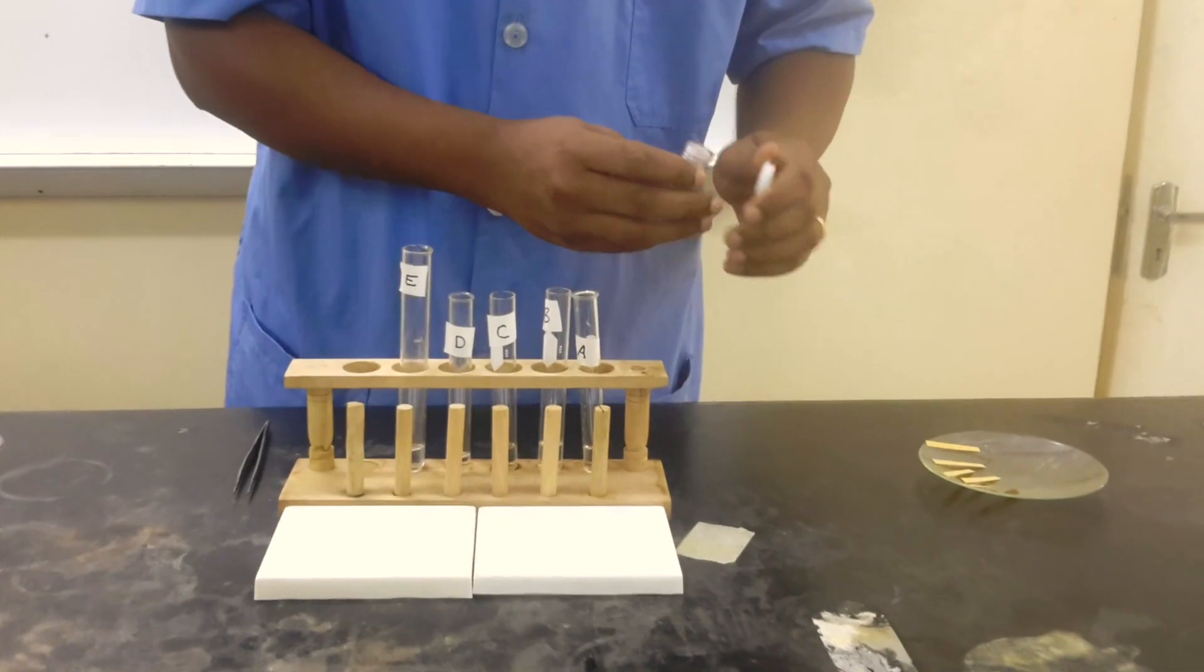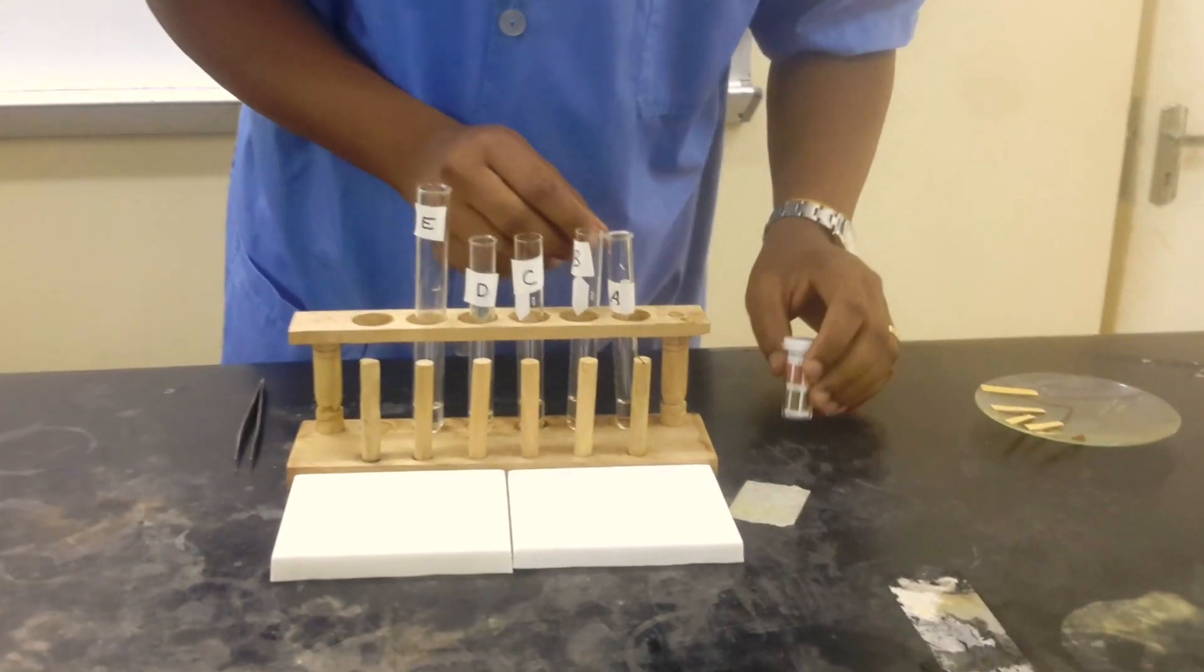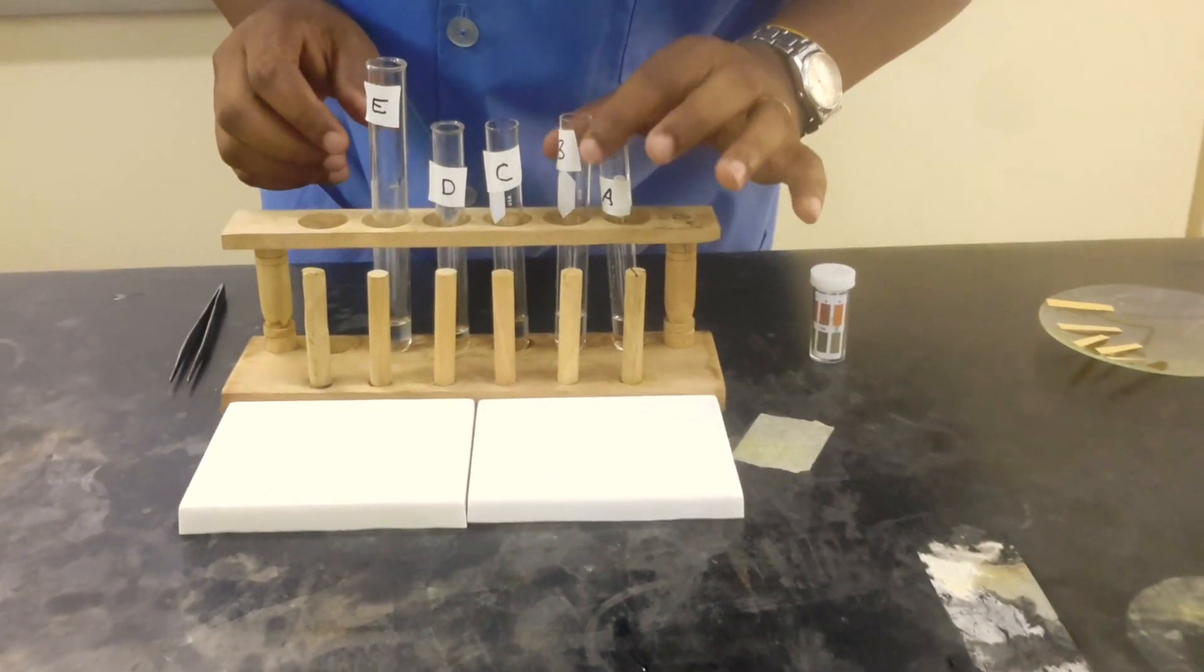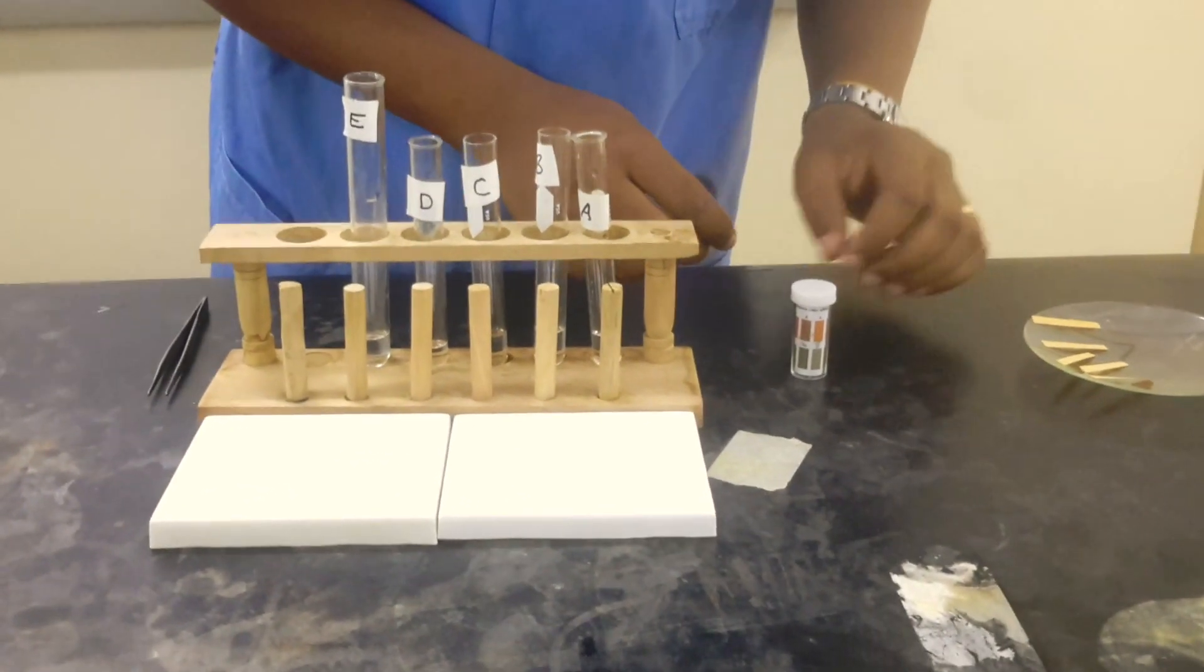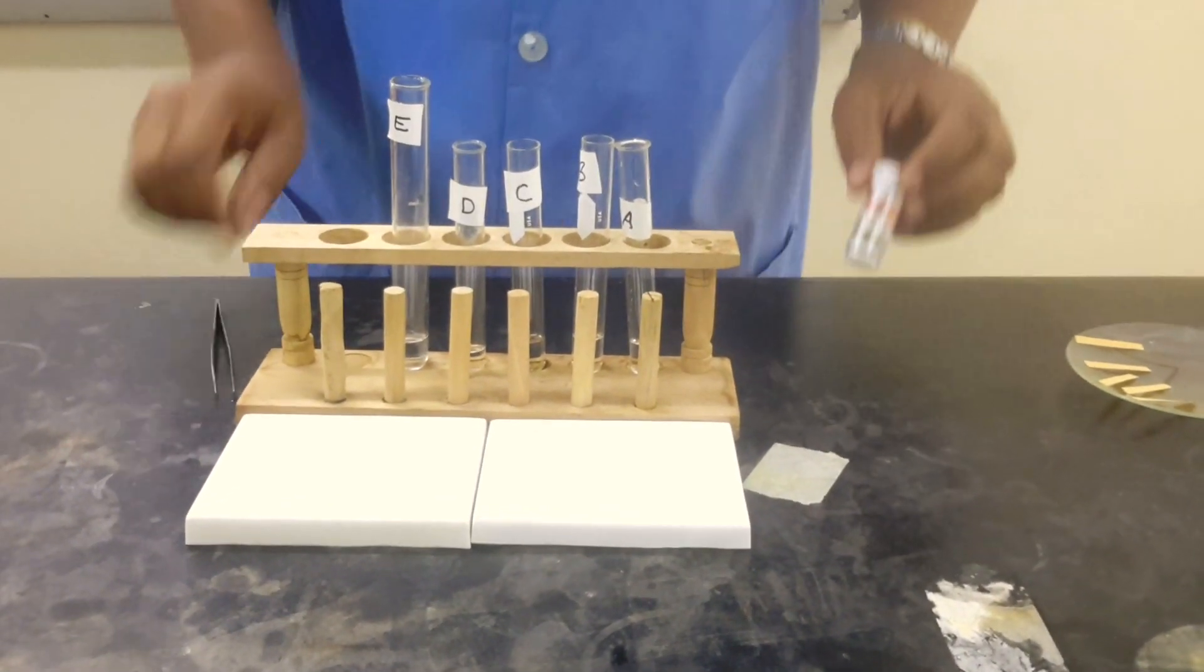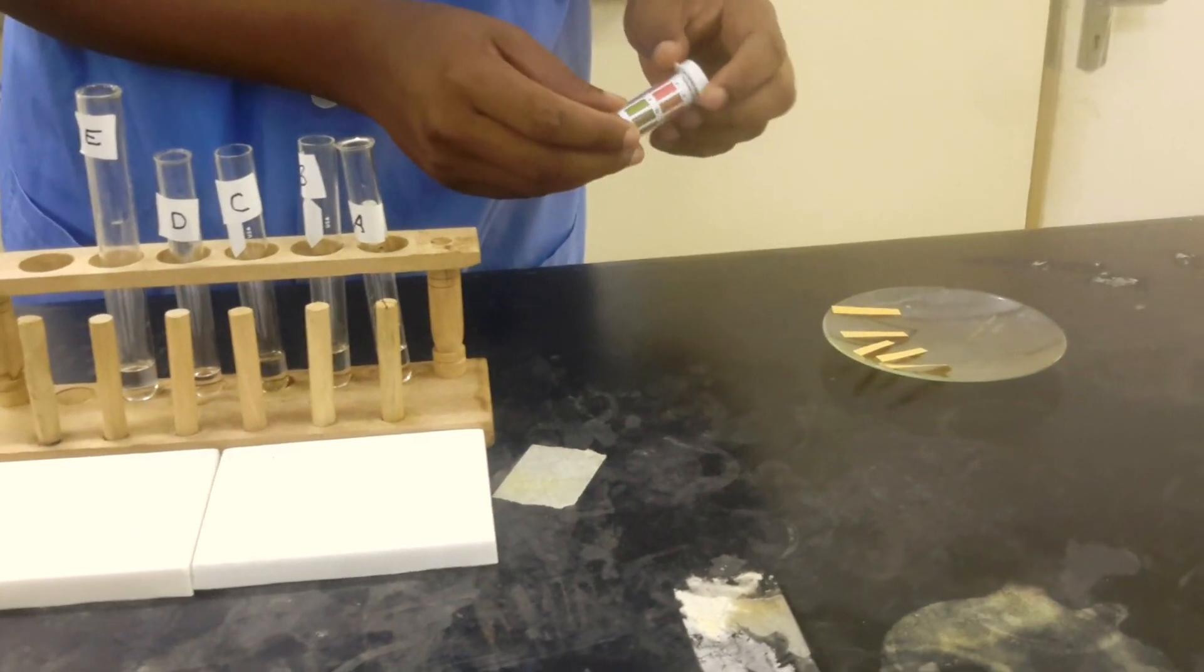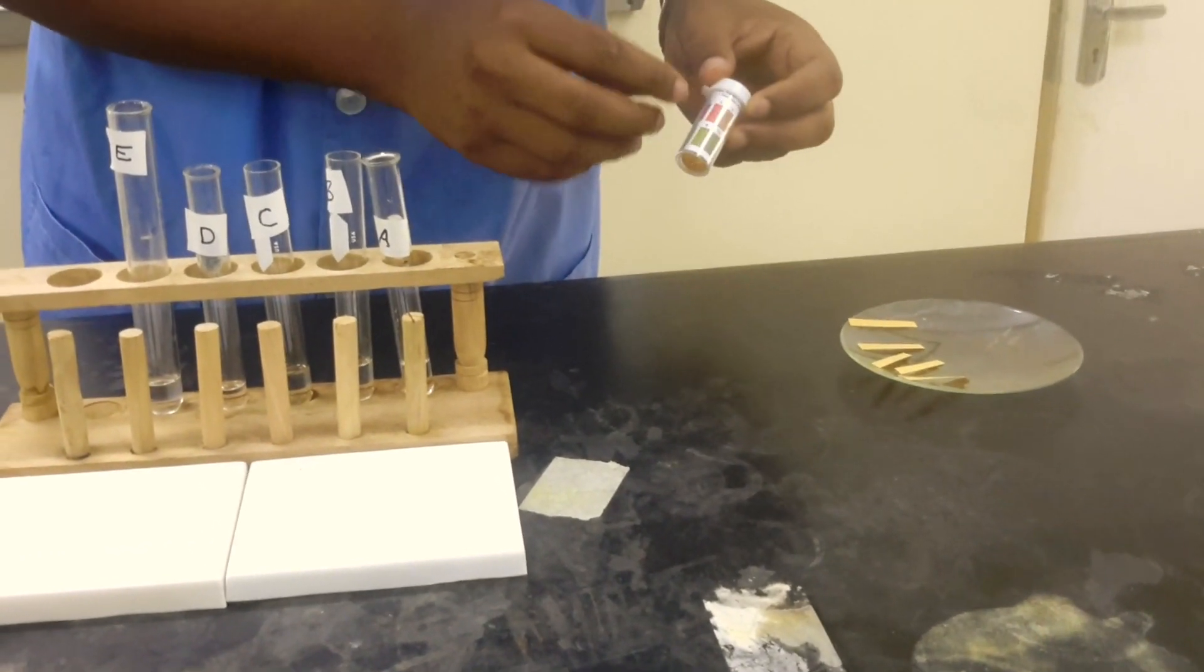We're going to be using universal indicator, so we're going to take a little bit of each solution A, B, C, D, E, and we're going to drop it on a strip of the universal indicator paper. Then we're going to match the characteristic color change that's given and determine its pH.